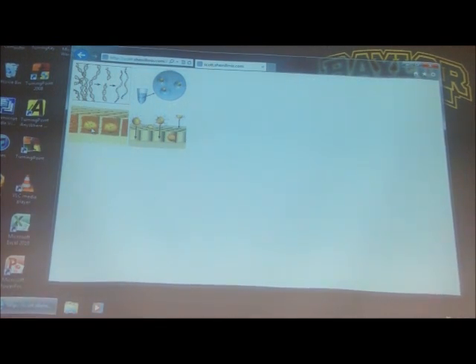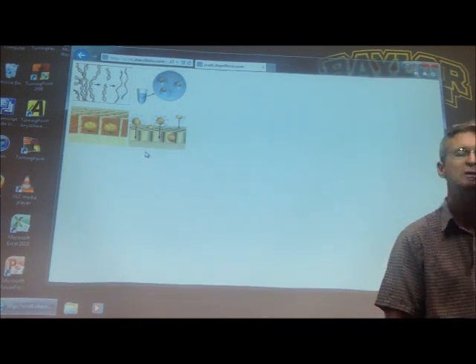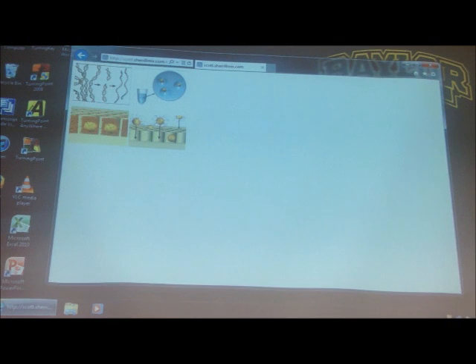Then you put the DNA into wells. Each micelle fits into one well. And this is not a big well like an ELISA plate. This is a super teeny tiny microwell. It's microscopic. And then we're going to do something called pyrosequencing, and we'll have to go to another image to look at that.